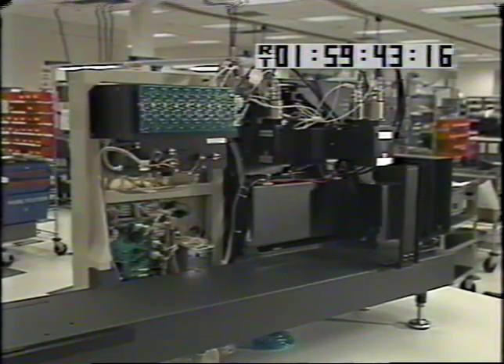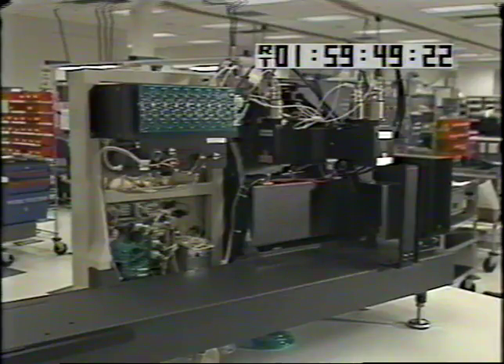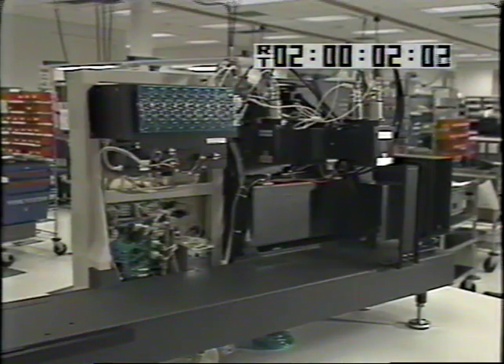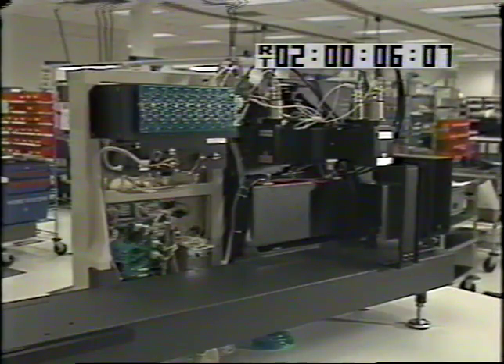We've now arrived at the end of the manufacturing assembly line, which is our workstation 9, and here you can see a base casting now with all the elements assembled onto it, which is shortly to go off to our test process to start the final alignment and testing of the product.